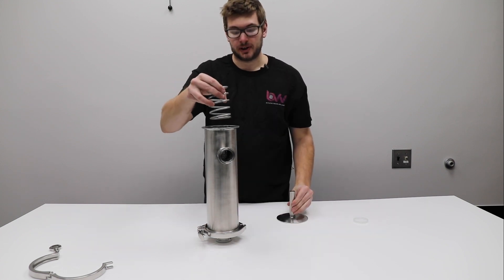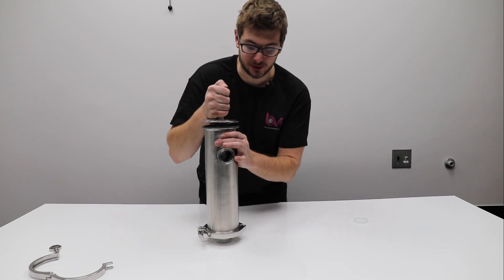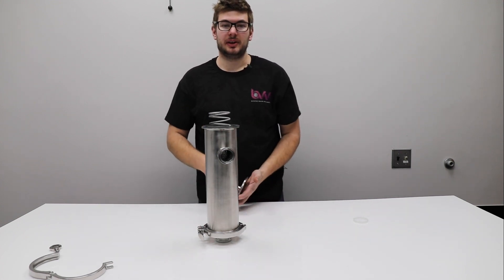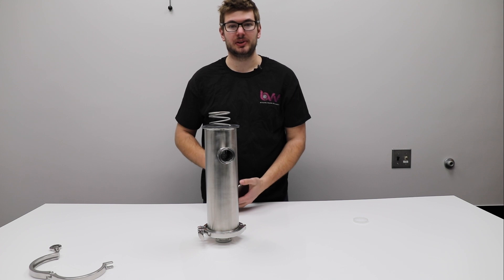The spring goes right over the handle on the cap, and now you put the gasket on and the lid on the spring. Then it's a two-person job again — you're going to have to compress the spring while your partner puts on the clamp. It's just that easy. You can take it off and clean it as many times as you need per day. This is a really simple way to take care of any particulate in a system.